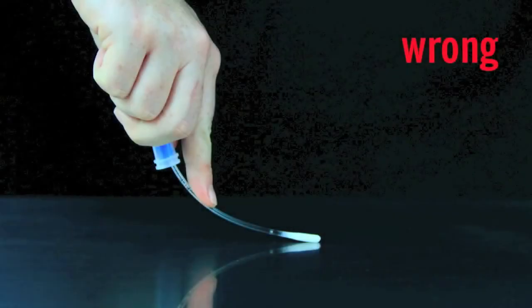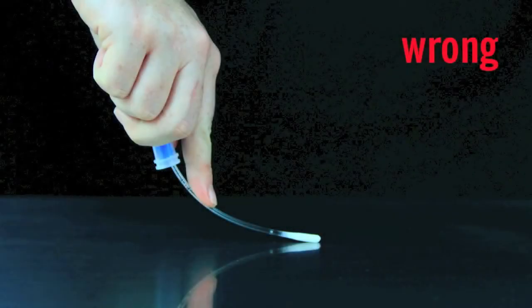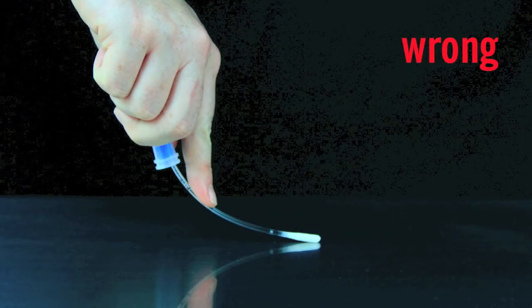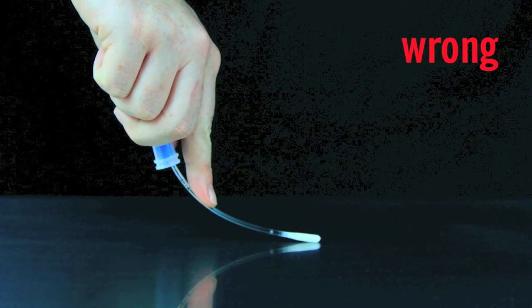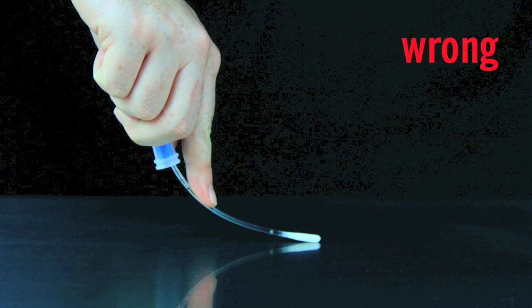Be sure not to touch the swab shaft while collecting sample. Touching the swab shaft contaminates the test and will produce inaccurate results.